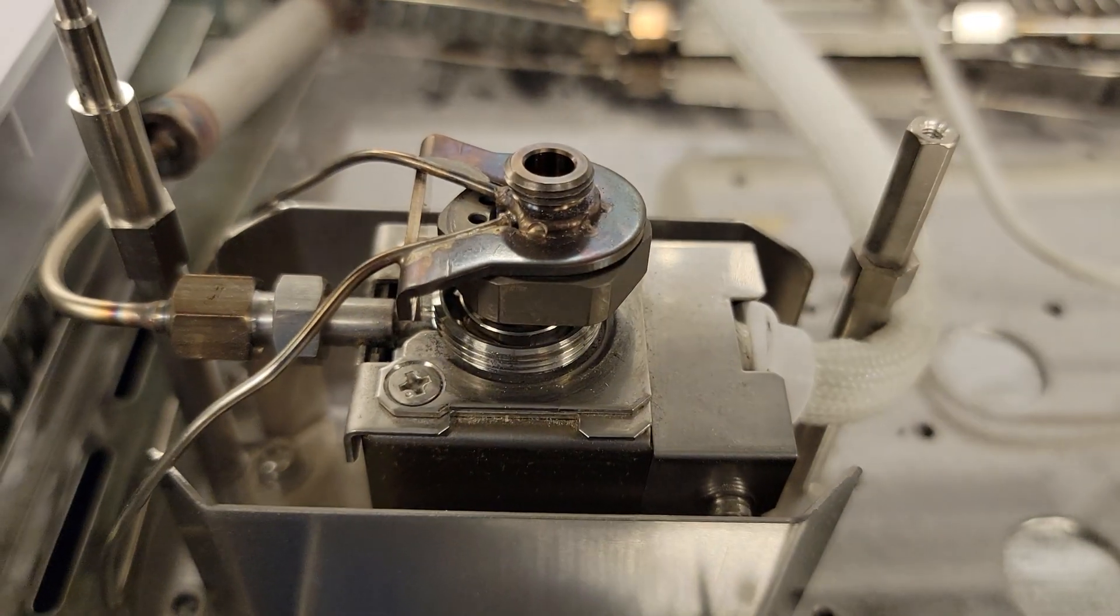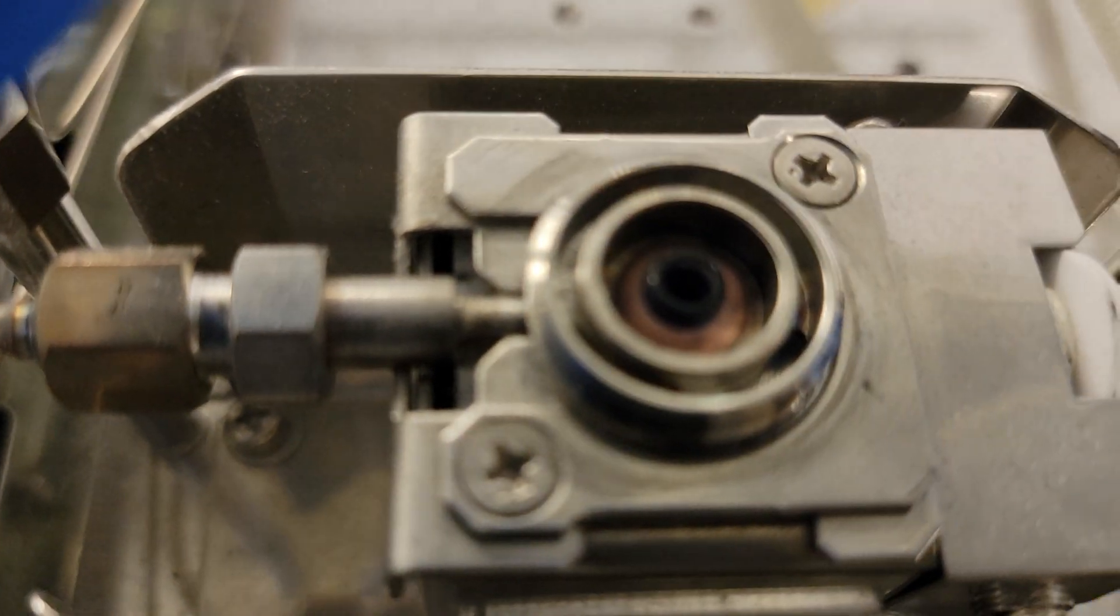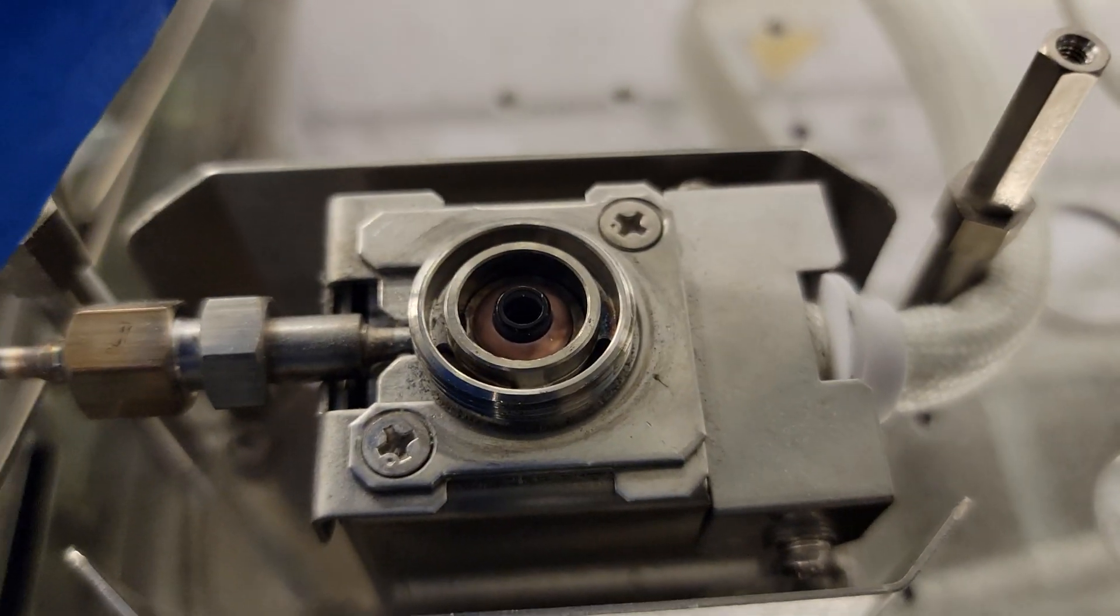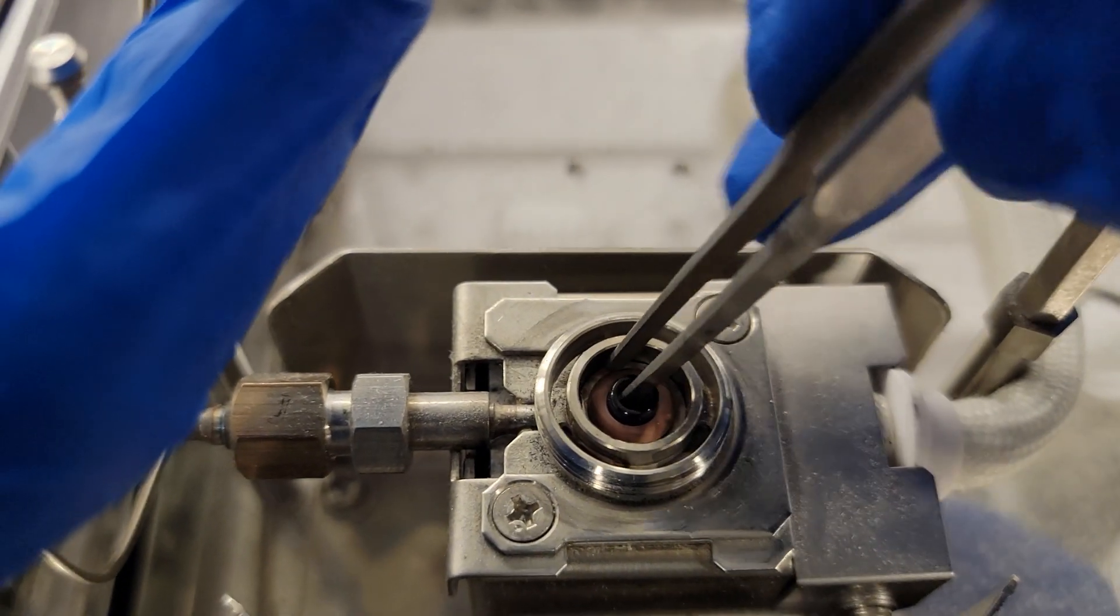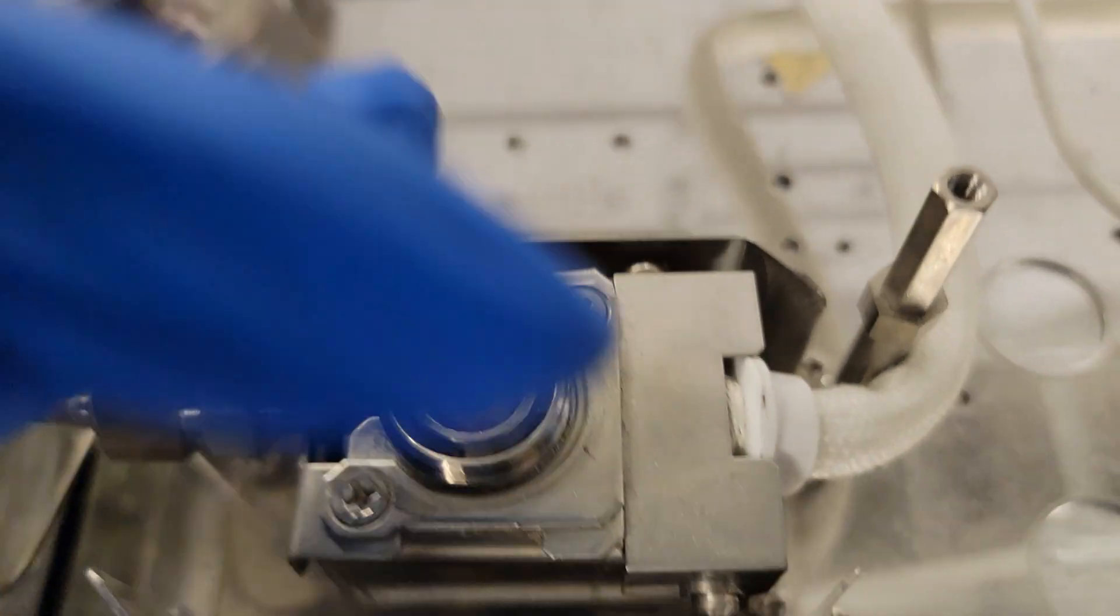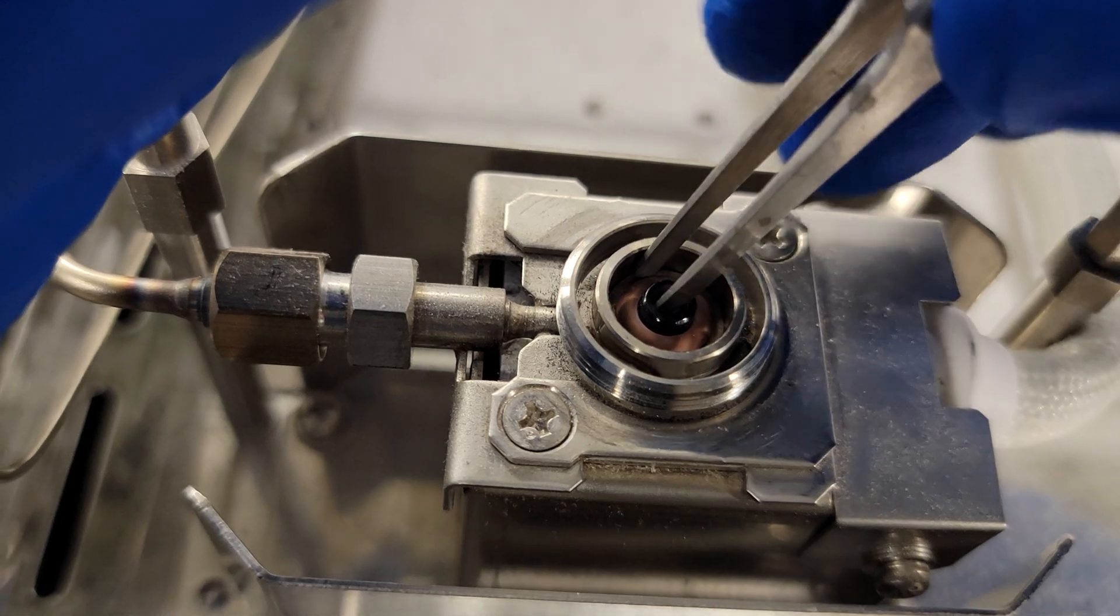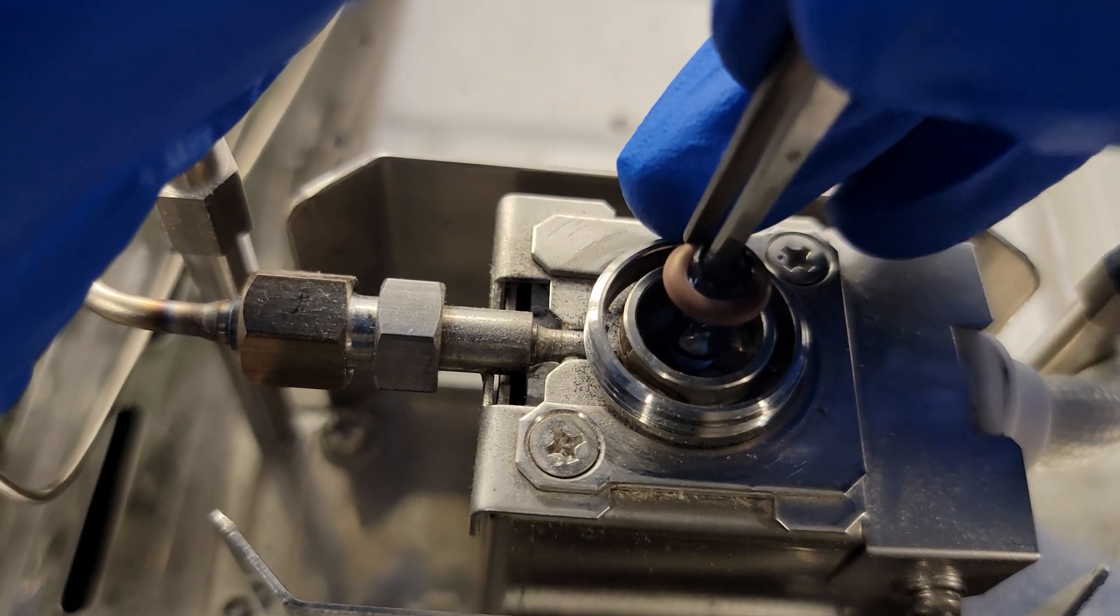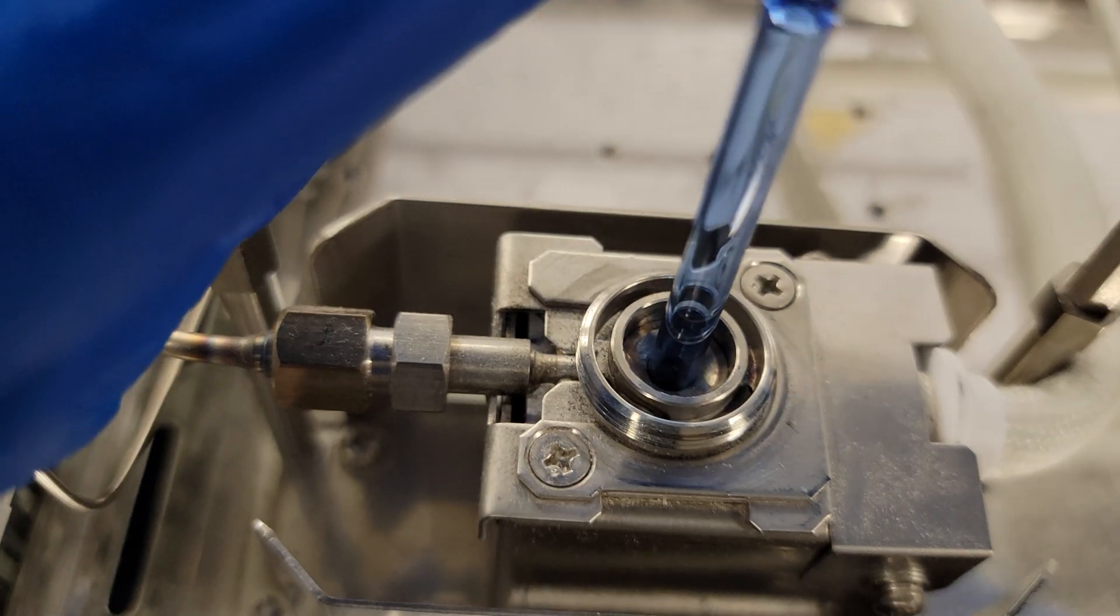The only sort of tricky part - there we go, perfect. We need to pull this out. I might need two hands for this, but we'll see. You can use your fingers or tweezers like this and just pull this whole thing out just like that.